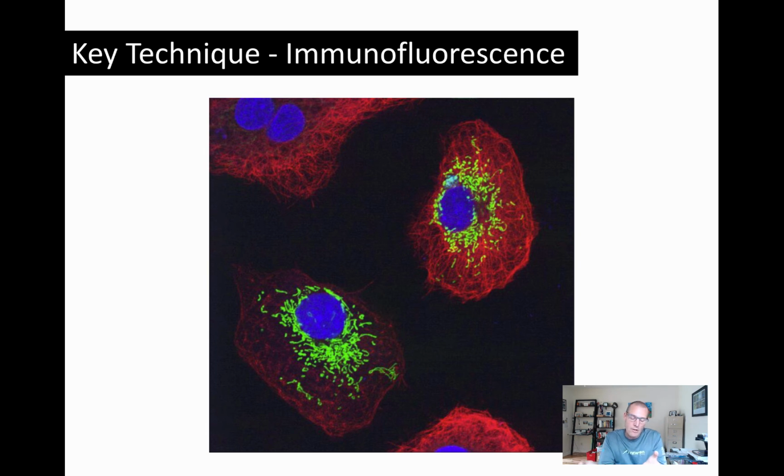You can link it to the DNA of a protein you're interested in using genetic engineering techniques. And here it's some protein which goes in the mitochondria. And so wherever that protein goes in the cell, when we express that protein in the cell, the fluorescent molecule goes with it, and then we use our fluorescence microscope.